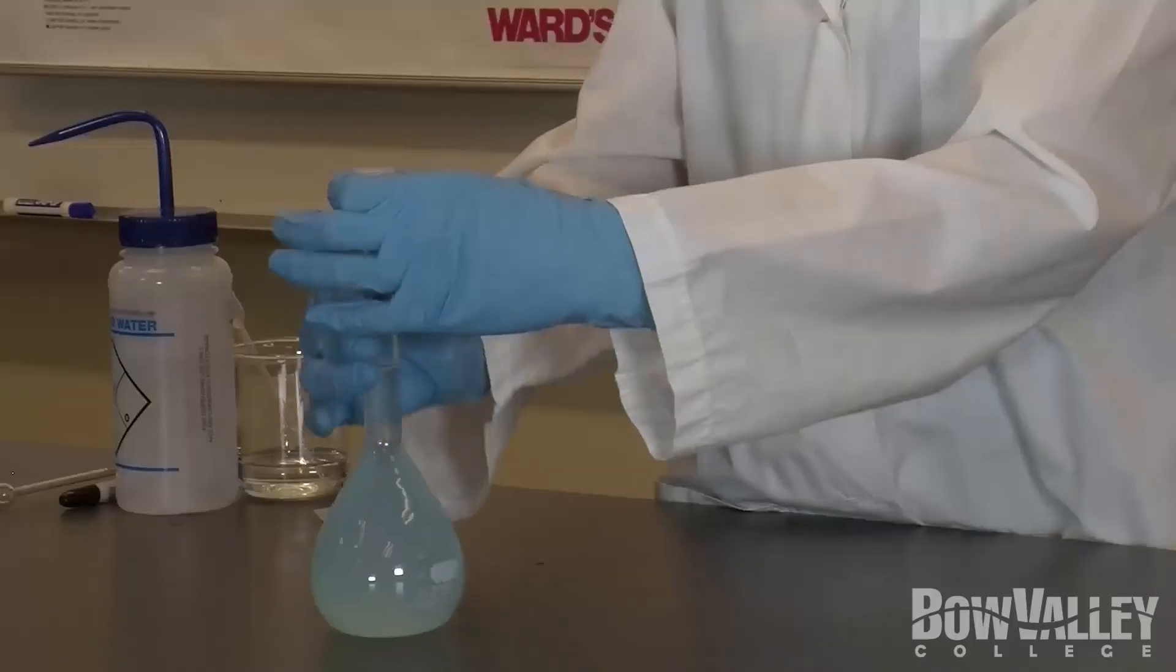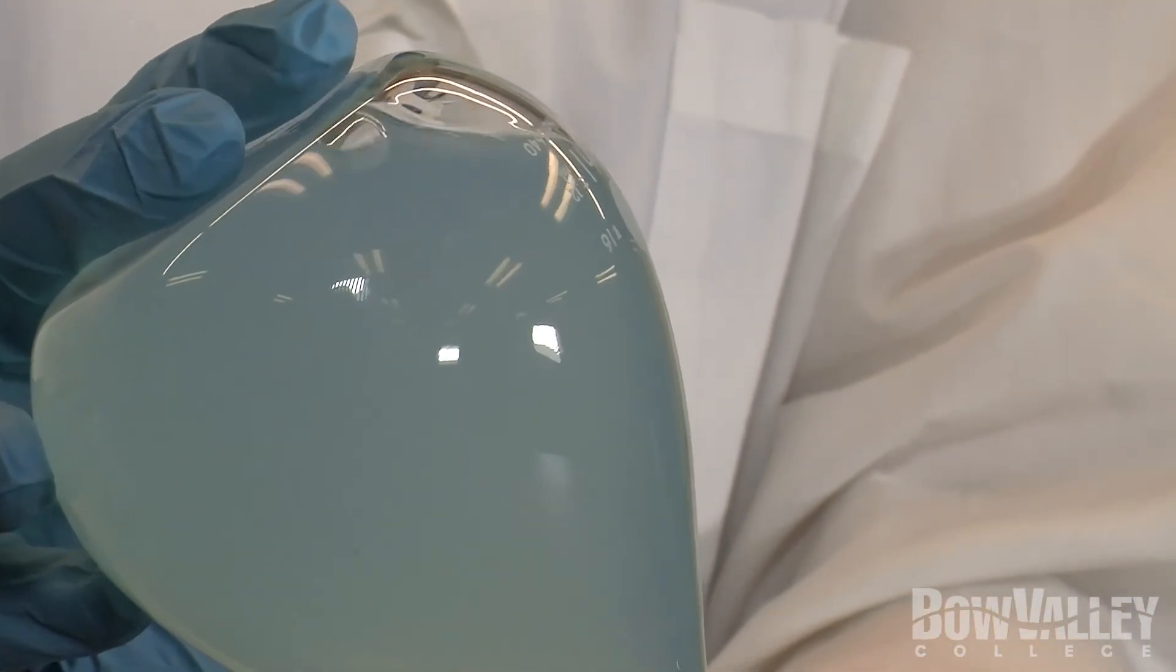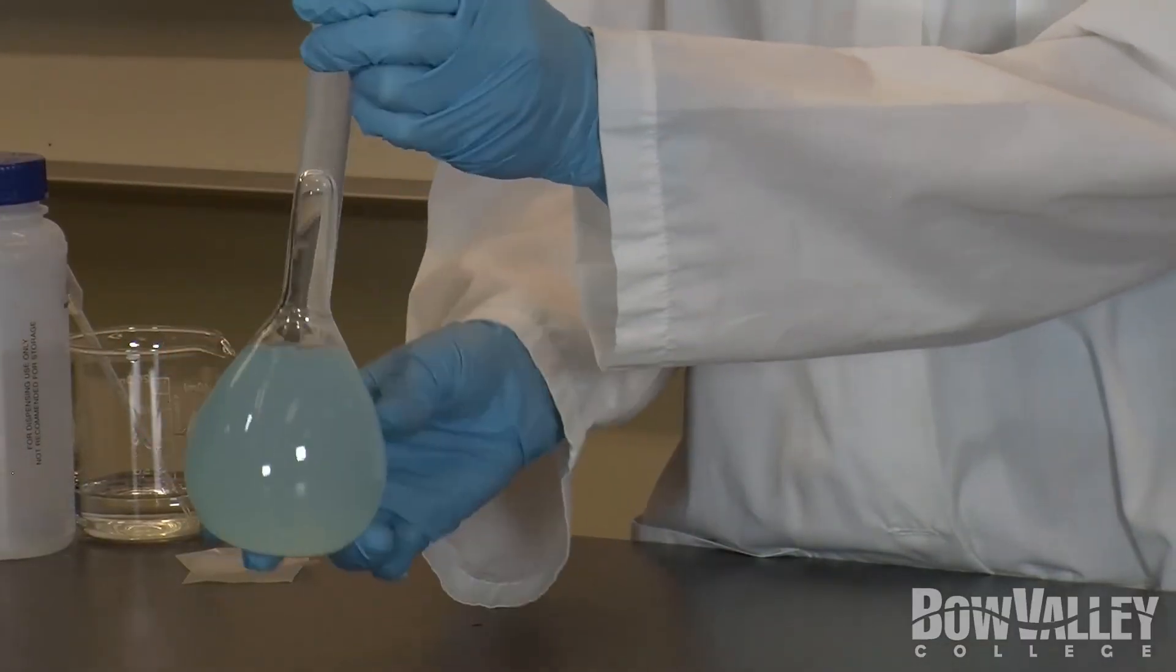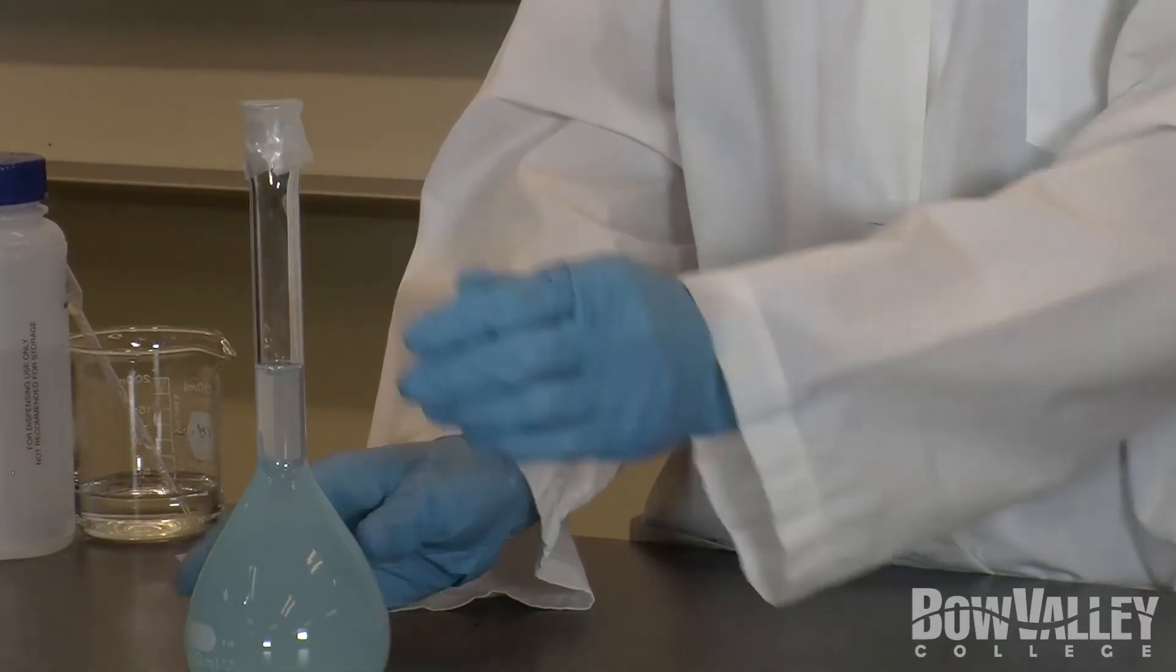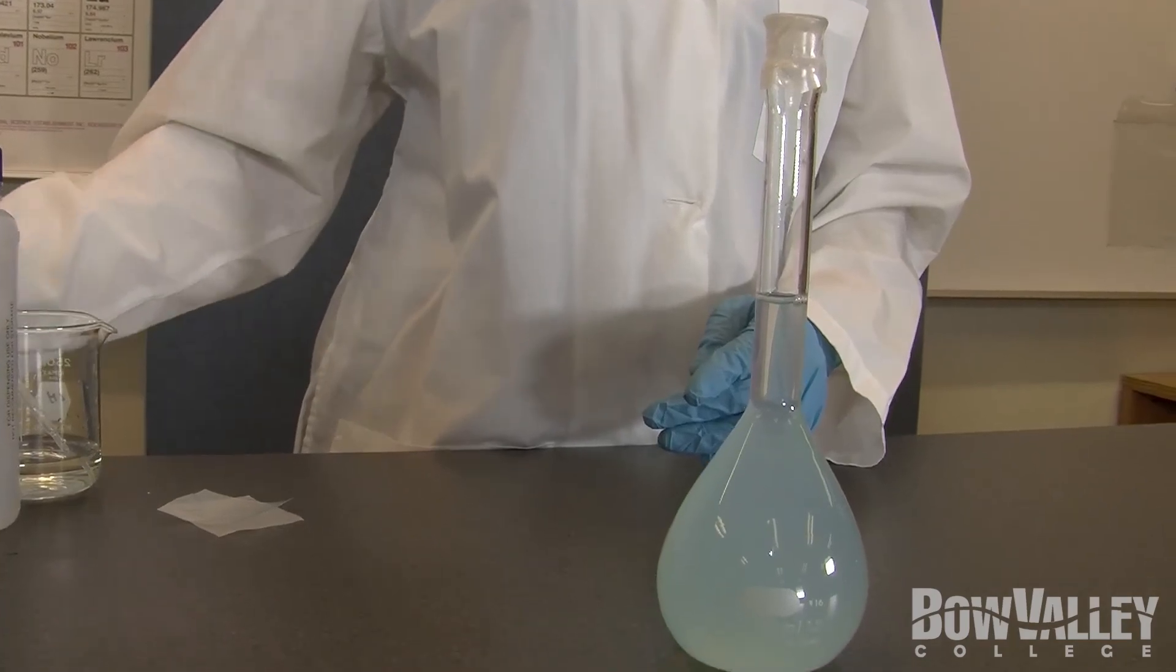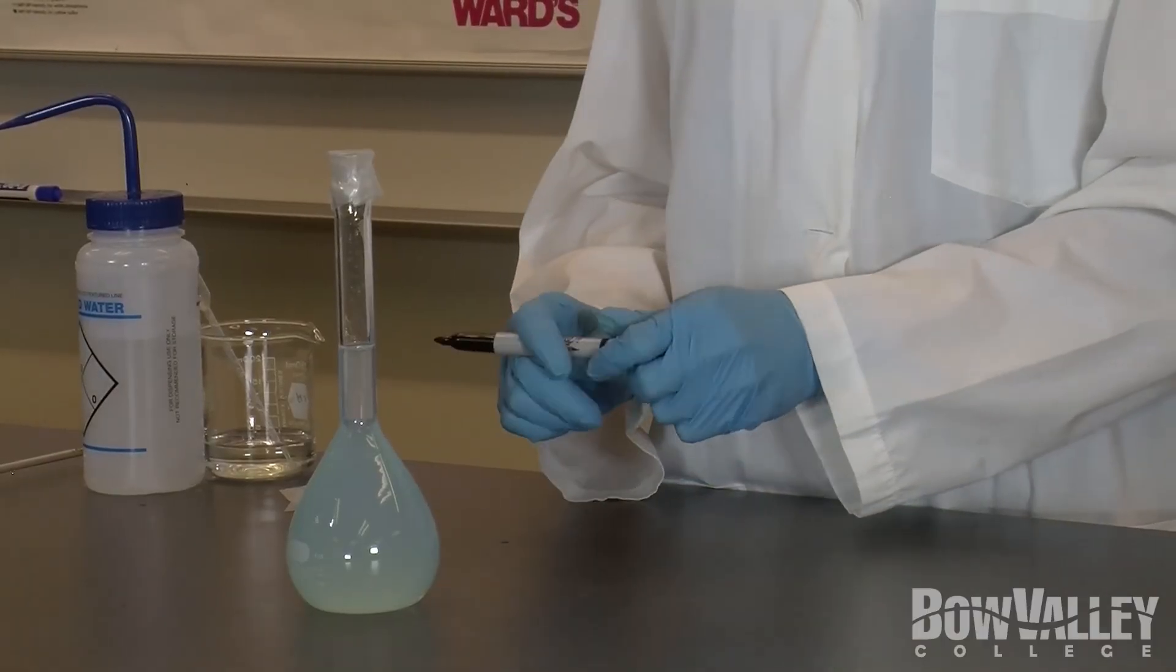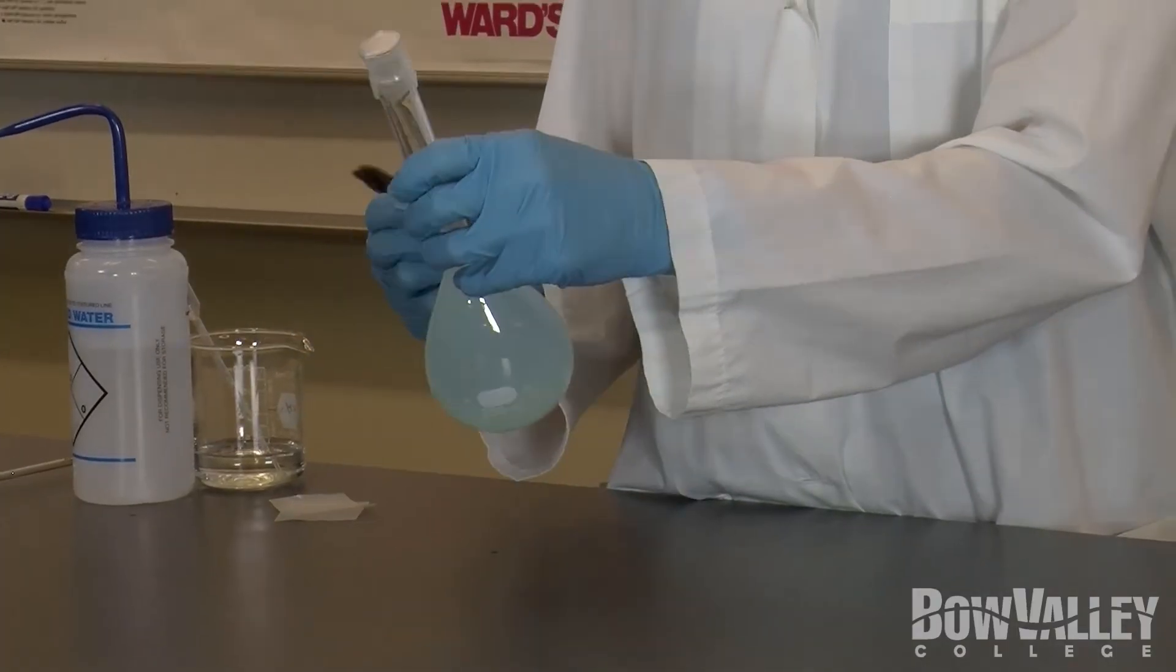Seal the flask with parafilm and gently invert to mix thoroughly. Label your flask. Your diluted solution is now ready for use.